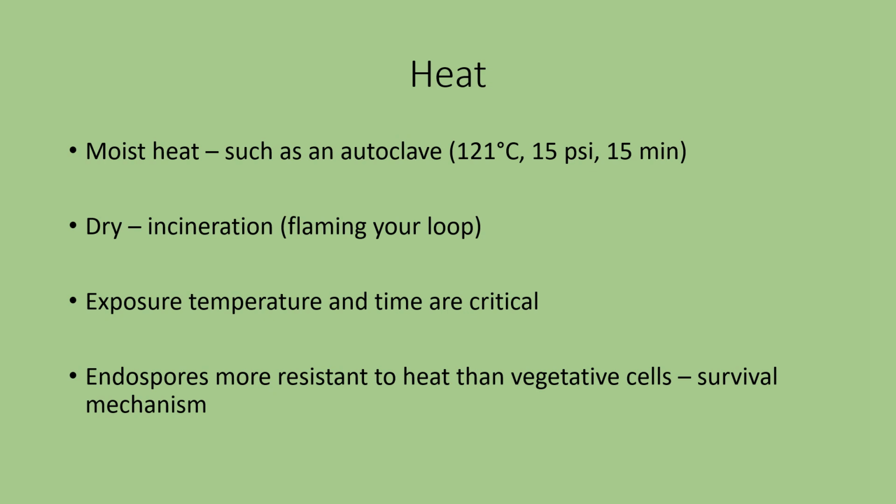If you have a larger flask, say 2 liters of volume, you're probably going to have to go a little bit longer for the heat to be able to penetrate deeper into that amount.